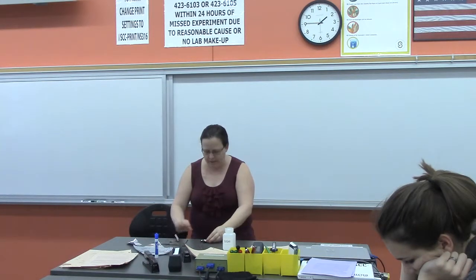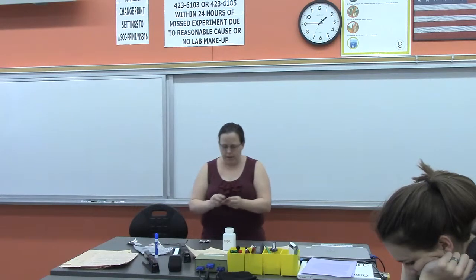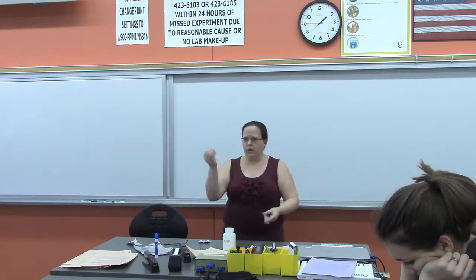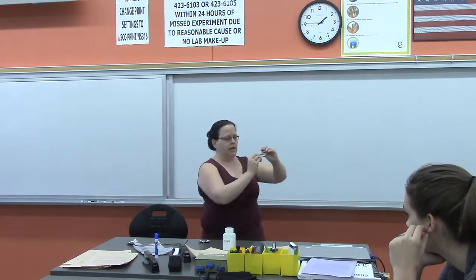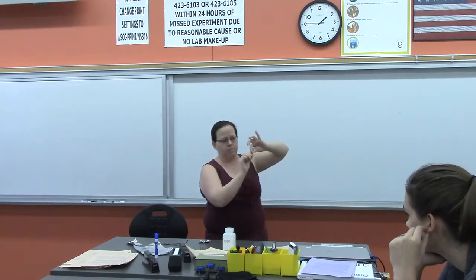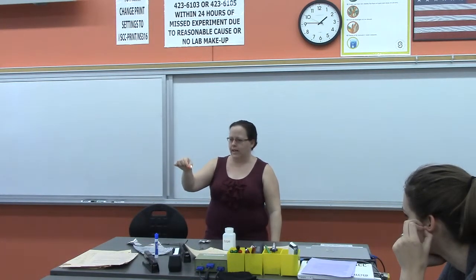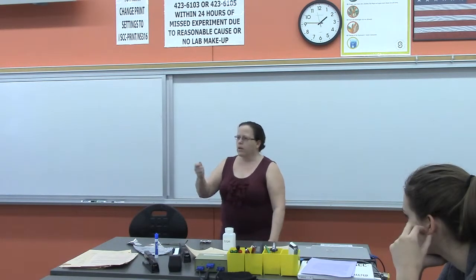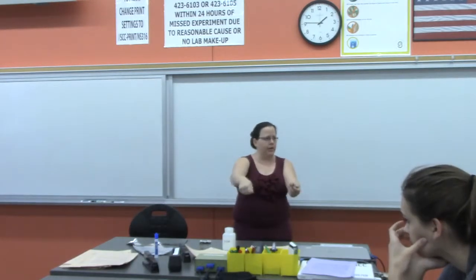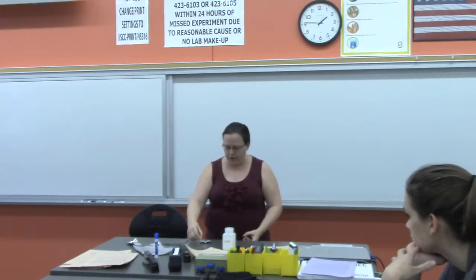So the way you want to do that is keep your foils sort of close to flat on the table. So the liquids will be a little harder. You want to light your match. Easiest way to do that if you haven't used paper matchbooks before is just sandwich the match in the back, pull it, and then it'll light nice and easily. Let the match actually get lit so it'll stay lit. Then put that lit match on the foil next to your sample. Okay? You don't want to just sort of hold it next to it because you'll burn your fingers, so we want to set it next to it. And then you want to observe what happened near your lit match.